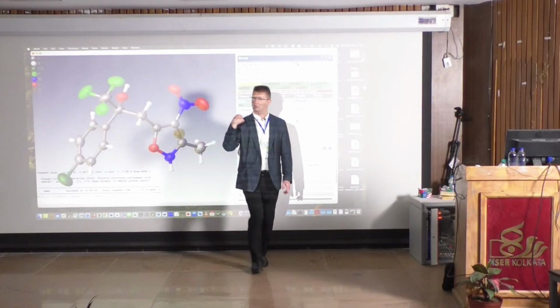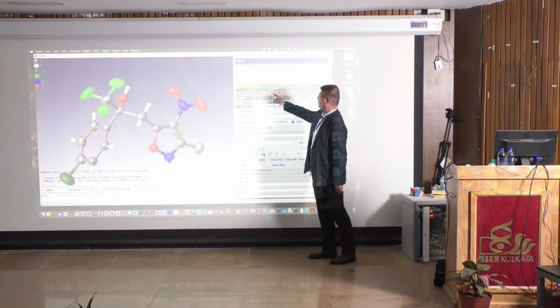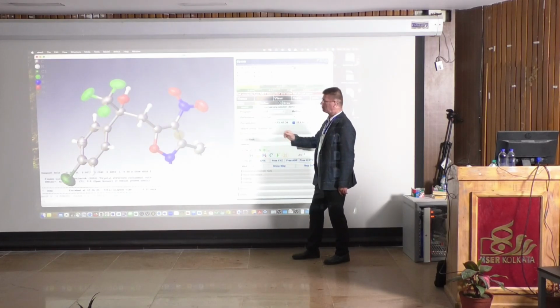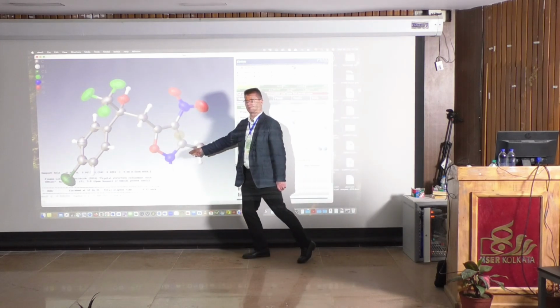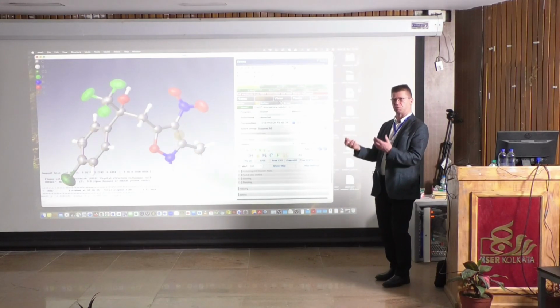But we were lucky enough that the computer program told us now there is something wrong, so we were sure that this is okay, but now the computer says, no, this is not the same as that one. And then we realized, okay, chemically, this is impossible. So our understanding and knowledge about the chemistry comes into play.